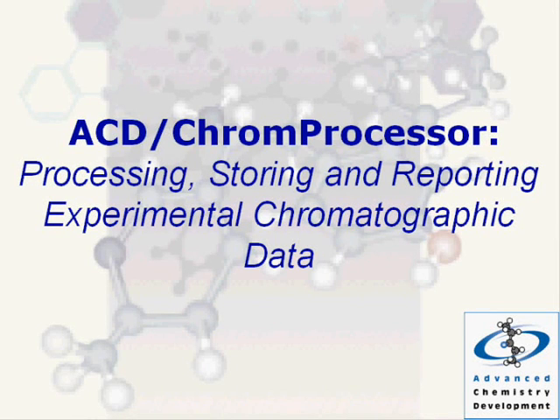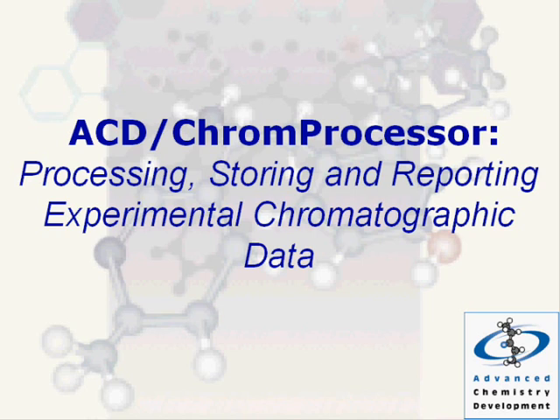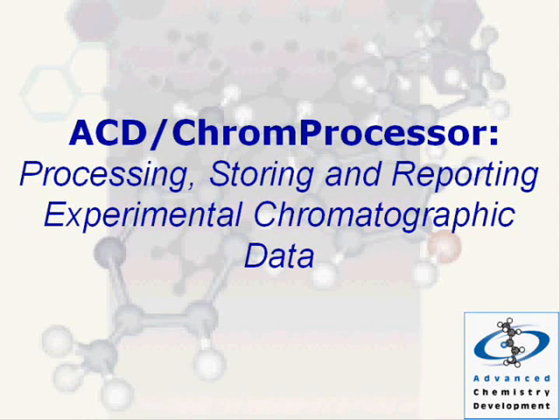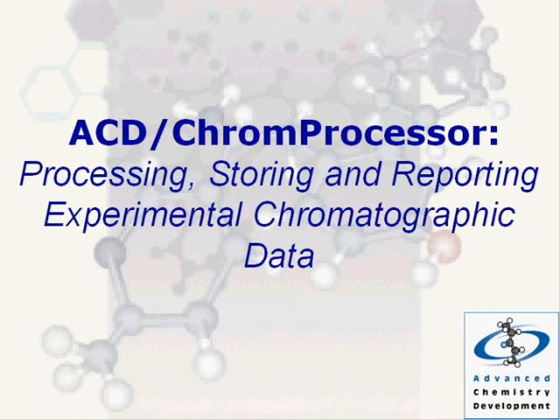ACD Chrome Processor – Processing and Reporting Experimental Chromatographic Data. Using ACD Chrome Processor, you can process chromatographic data from virtually any data system. This universal software allows seamless data import and processing, convenient automation, and efficient reporting of your results.